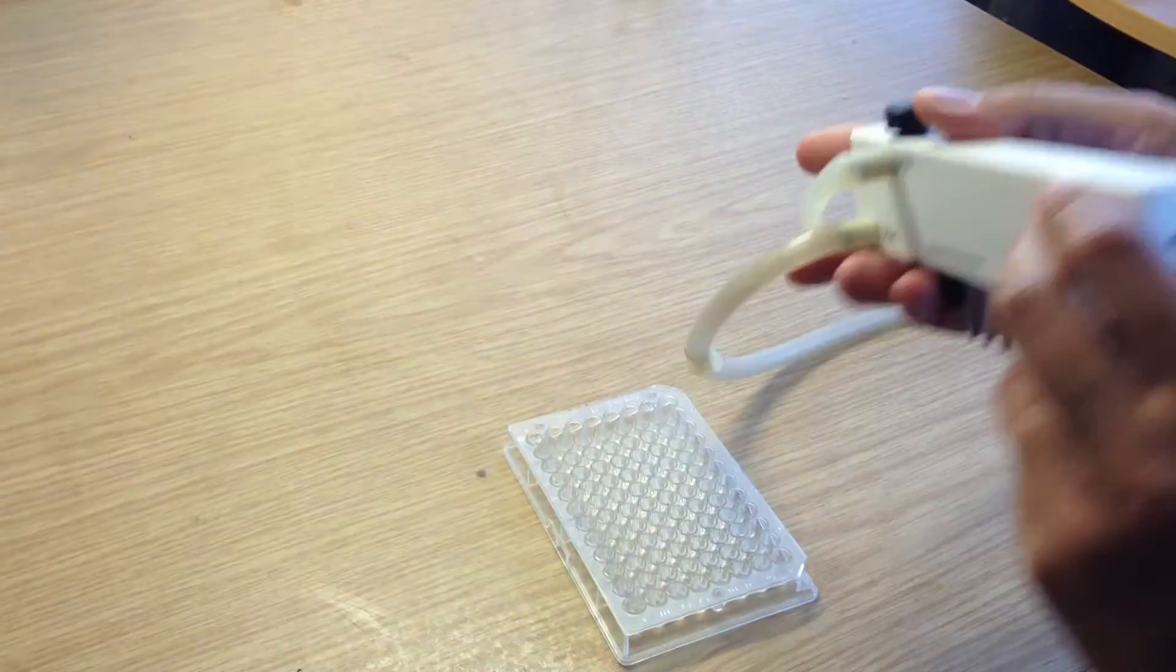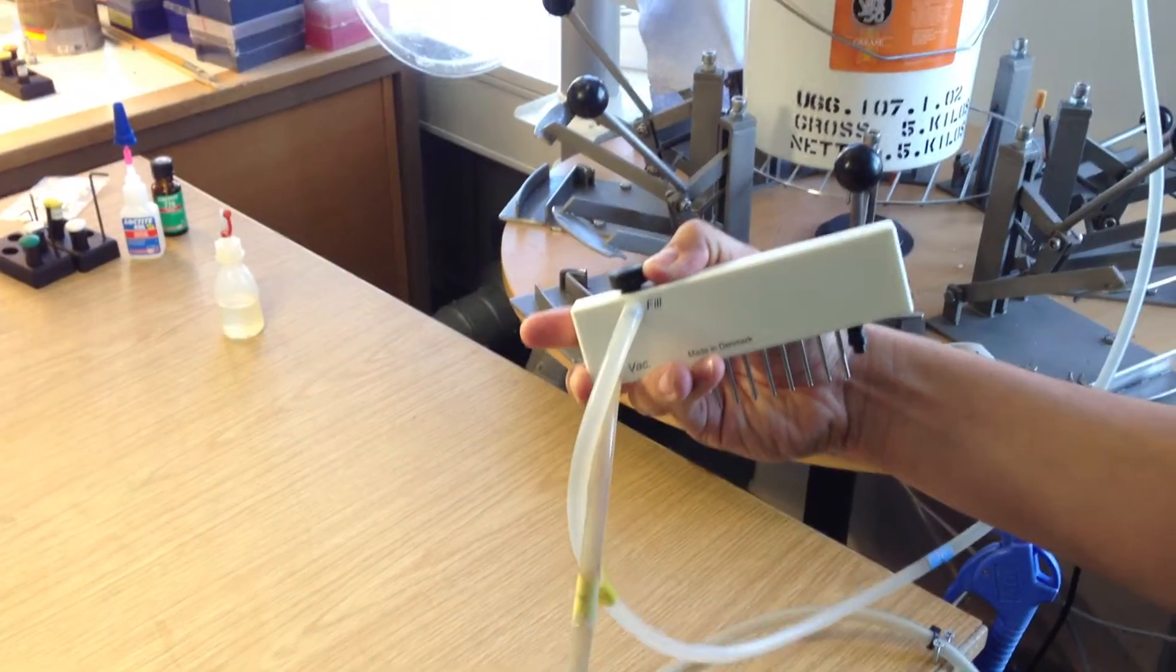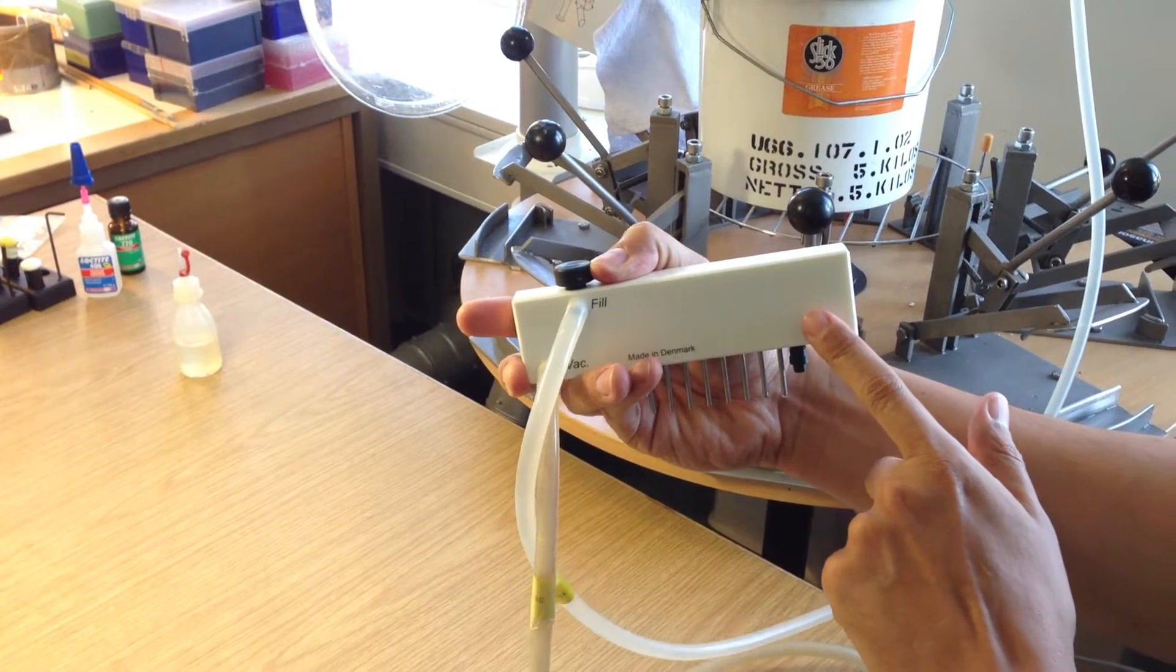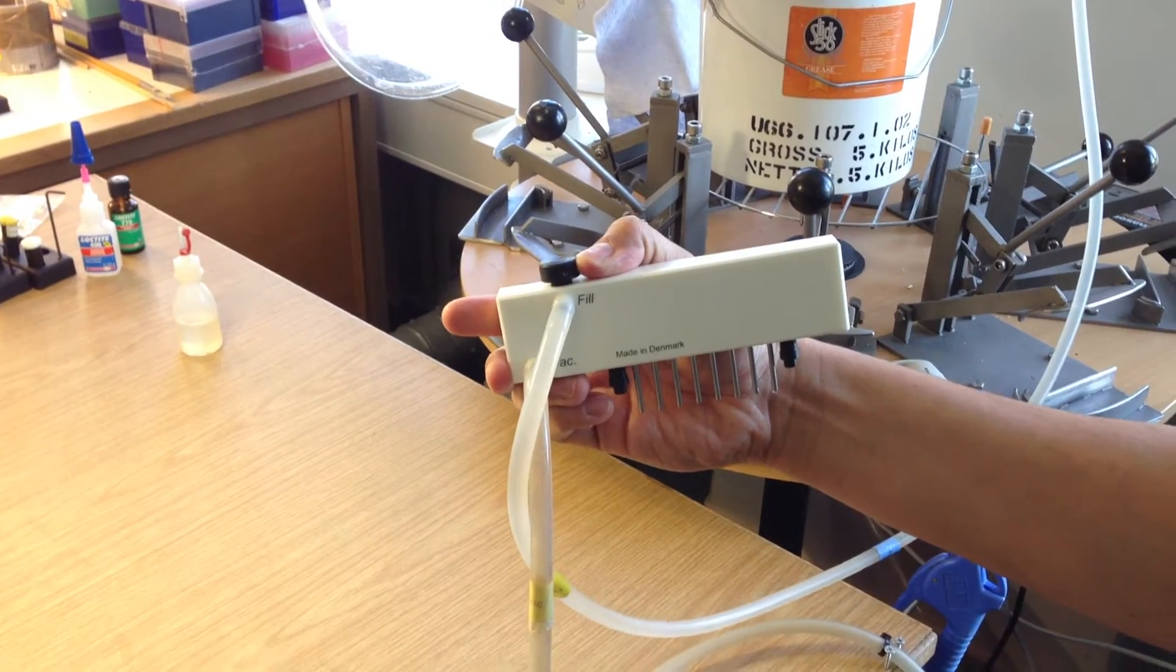So the way the system works is that you're going to put the silicone tubing on the fill for the washing solution bottle and on where it's written VAC for the trap and for the vacuum pump.